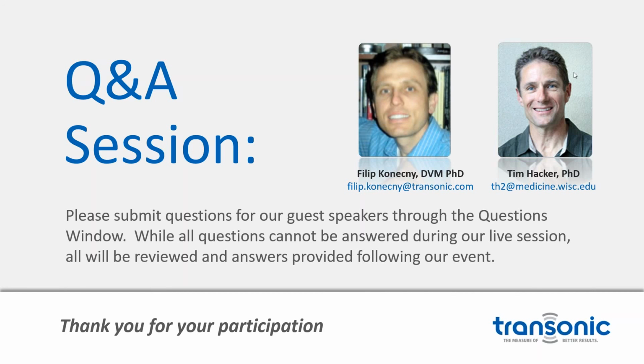But usually most universities have some sort of capital exercise that they can do, and if you can gain a few different researchers that are interested in doing cardiovascular research, normally they're happy to throw in their capital exercise money at the end of the year to buy one. You'll get pretty close. Administrators like it because there's going to be multiple users for the capital exercise type equipment, and that's how we got ours.